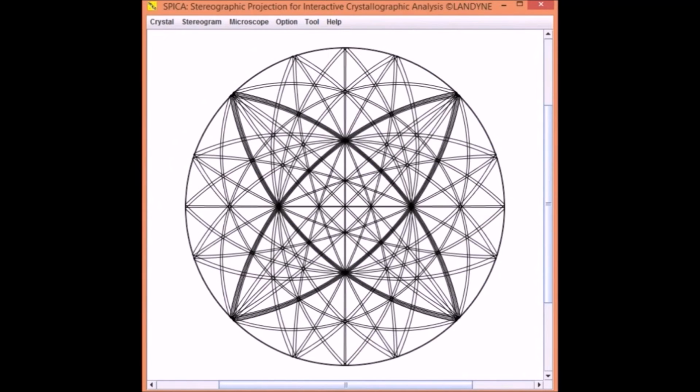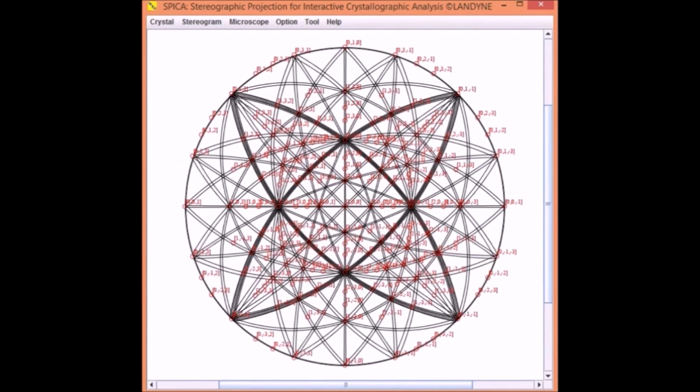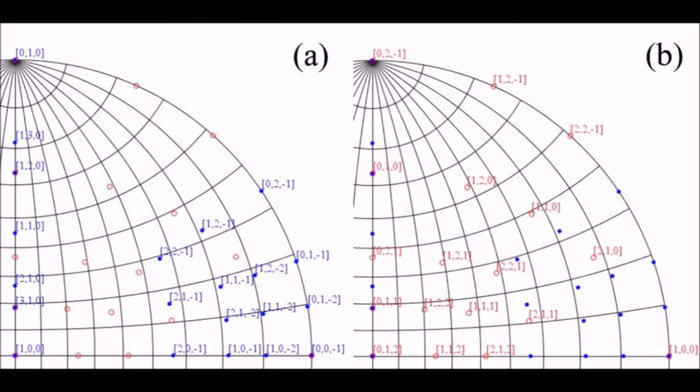One, you can show the Kikuchi map, and the other one to show the Kikuchi map index. If two phases have a fixed orientation, you can load these two phases in, and the composite stereogram will show the whole orientation relation between these two phases.